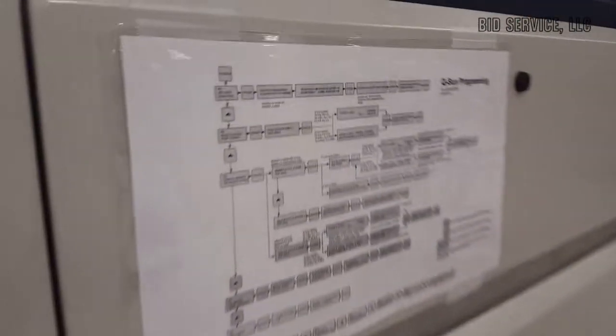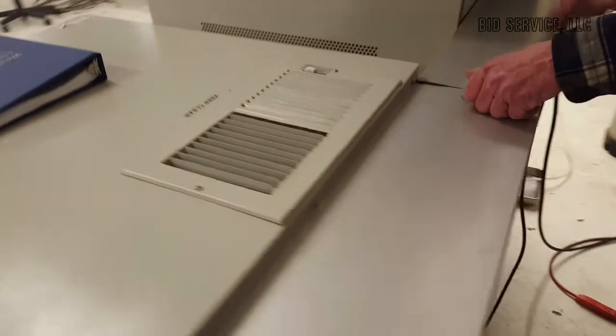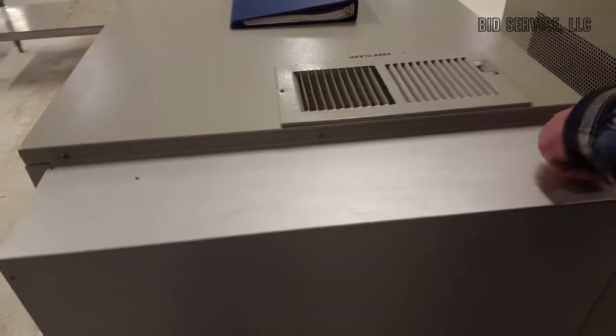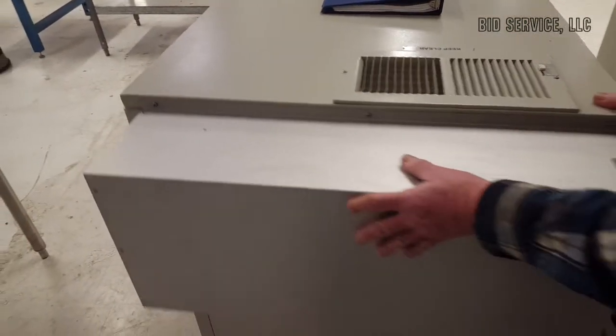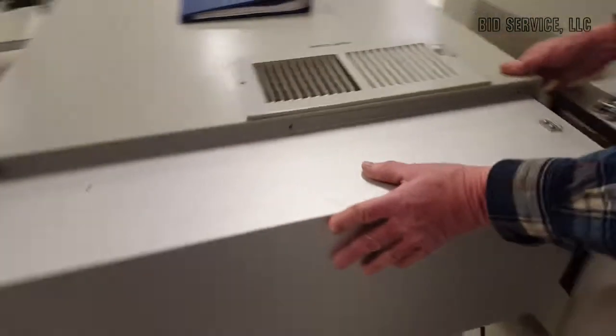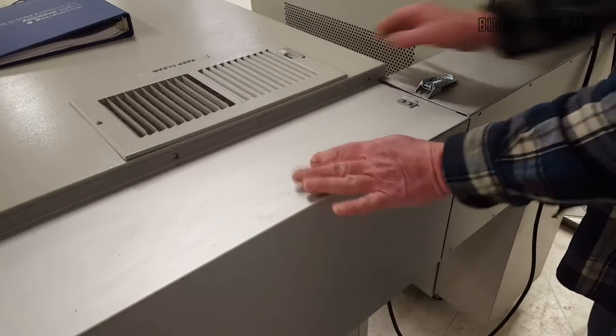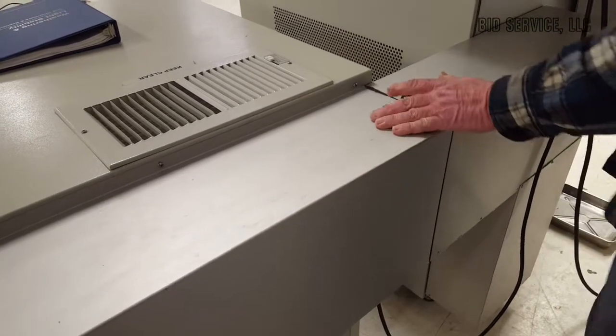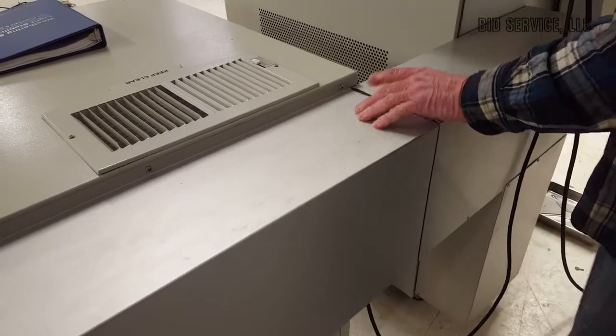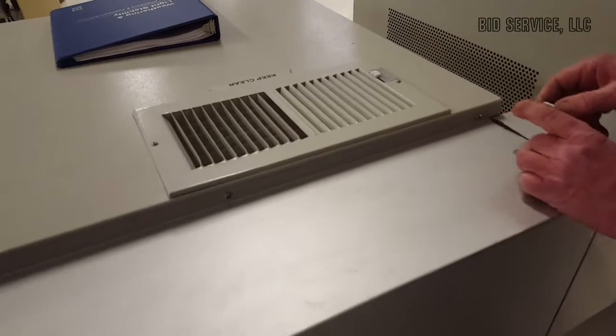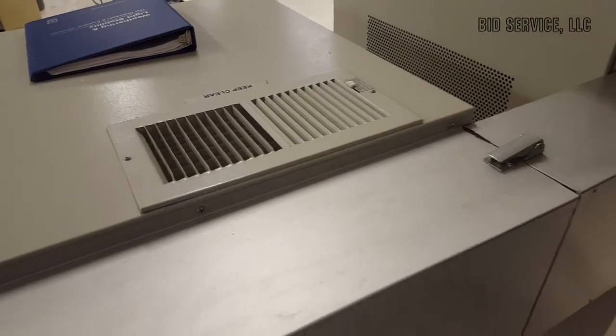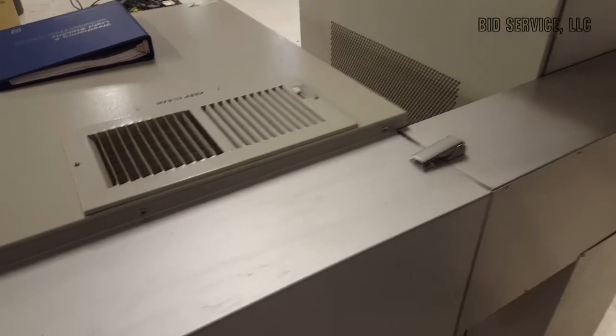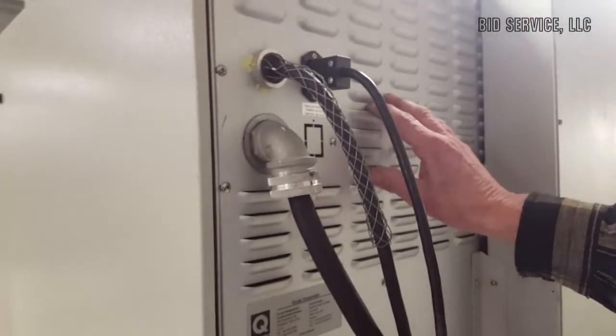If we step around the other side, all the way around the back again. This is basically an air conditioning unit. I just want to show you that it's completely removable, and it lines up just like that. You can bolt this duct on when you get it, and simply clip this in place. It is controlled also by the main unit as well.